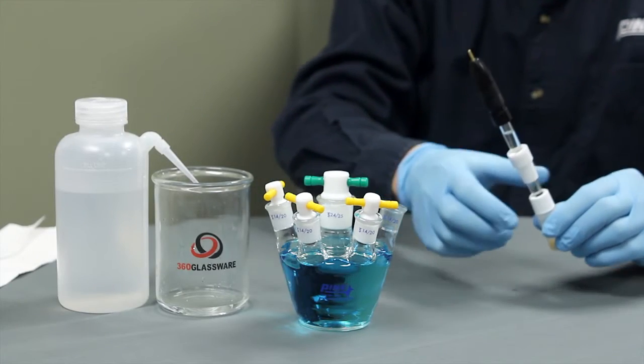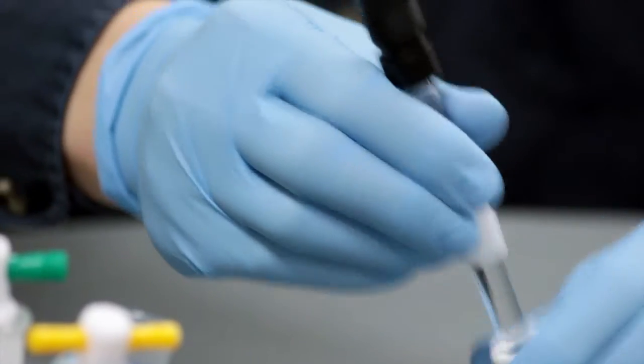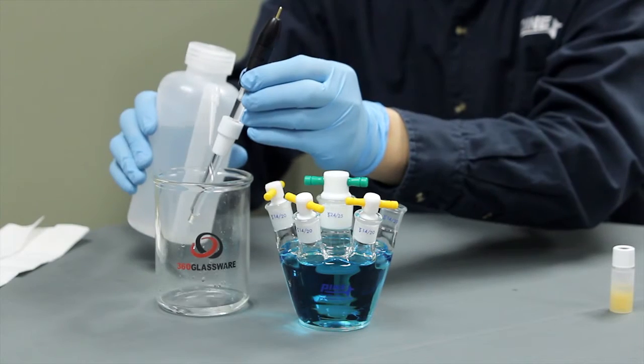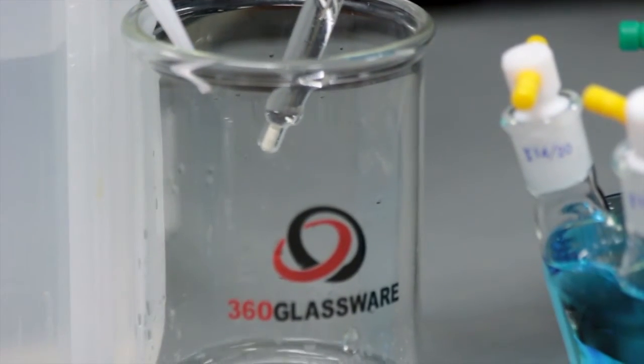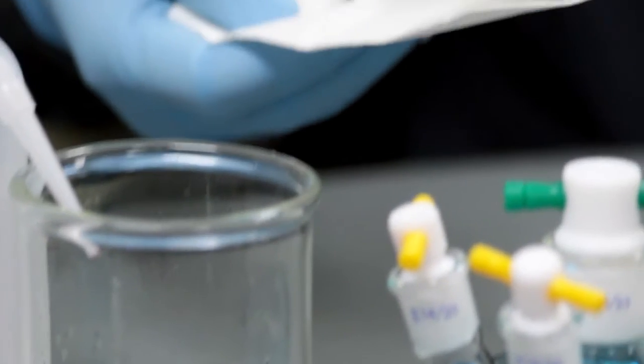Let's discuss how to use the electrode. First, remove the storage bottle and rinse the tip. Make sure to dry the tip with a paper towel.